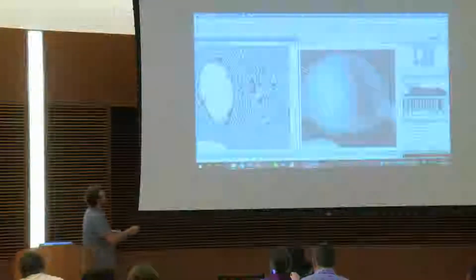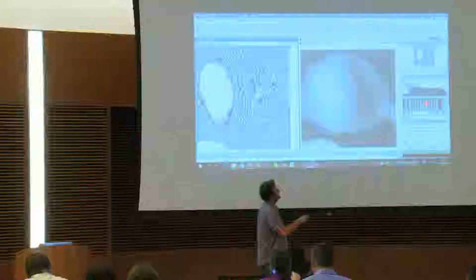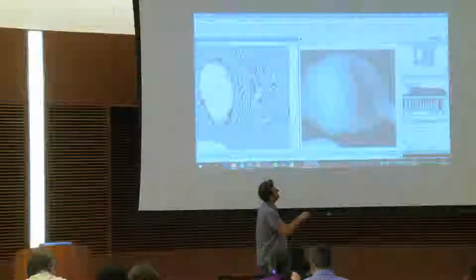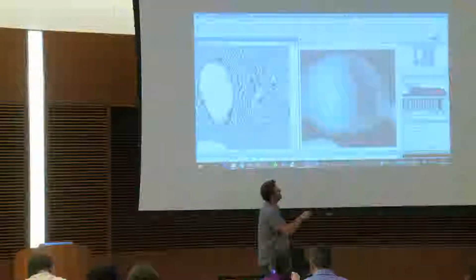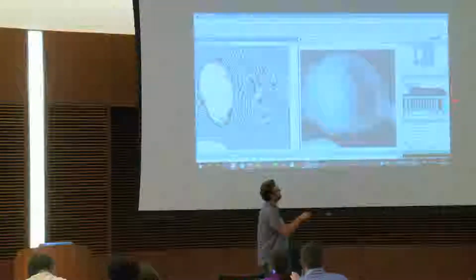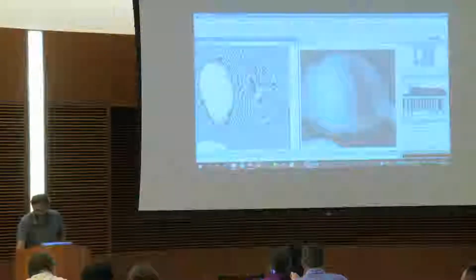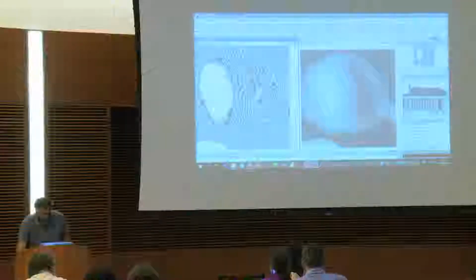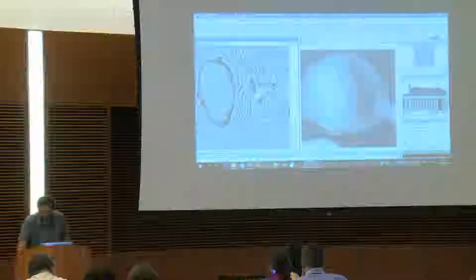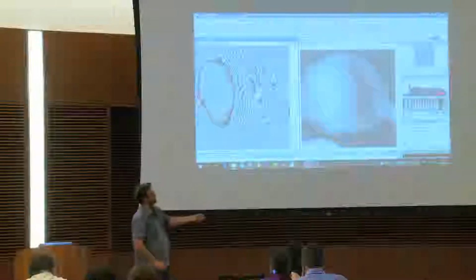It's because when I play with this boundary, the lookup table that I created here is going to be applied from this intensity to this intensity. Everything that is up to this bar is going to receive the same color that is the final color here. So here it is this white thing. So if I put gray, everything is going to be gray. And, well, it was just to mention this.